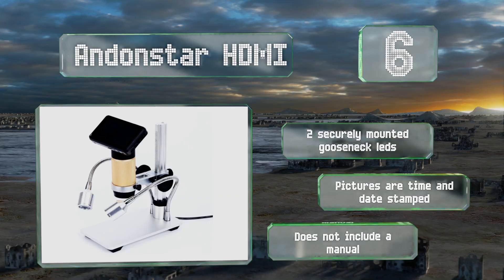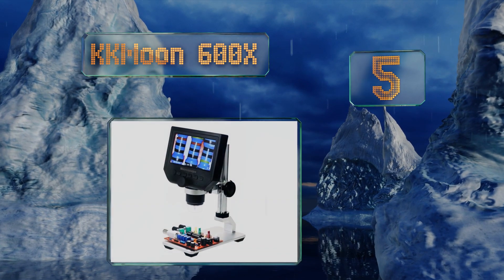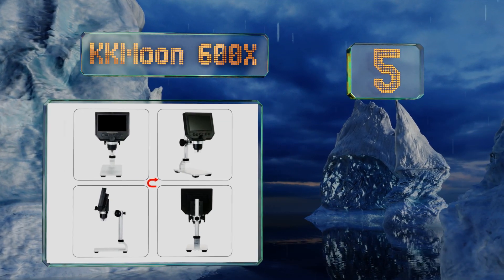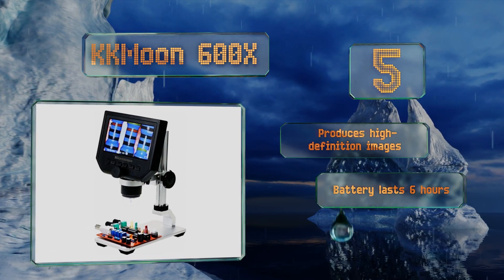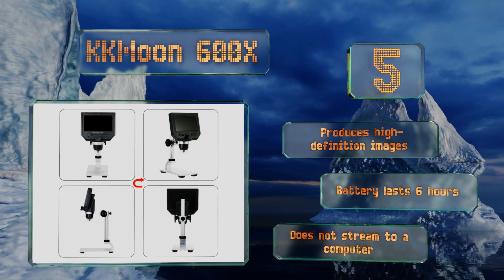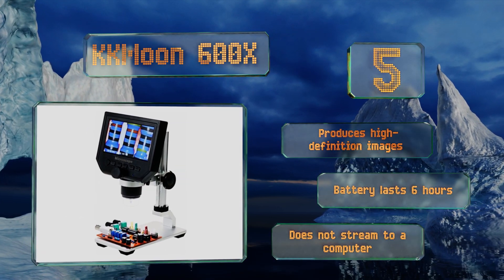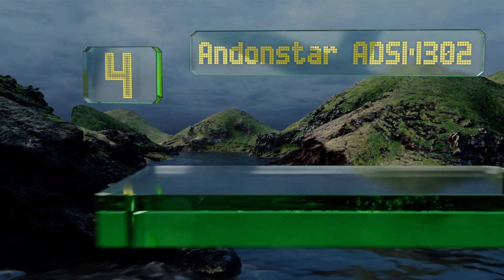Halfway up our list at number five, made with plastic and aluminum, the budget-friendly KK Moon 600x offers a 4.3 inch screen that's slightly bigger than most others. The camera height is easily adjustable via a large wheel on the bracket, which is mounted onto a sturdy metal base. This one produces high definition images and its battery lasts for about six hours, but it doesn't stream to a computer.